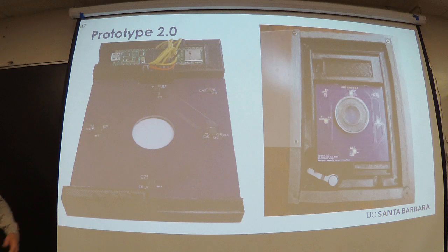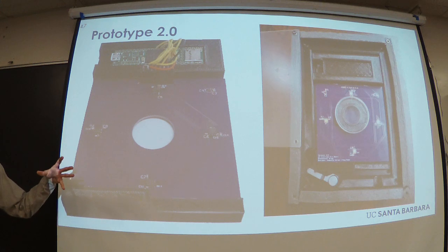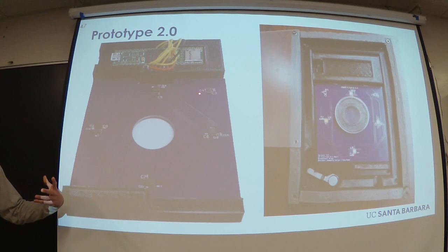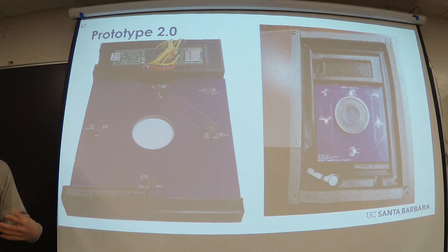And then this is prototype 2.0, with the microcontroller plugged into the system, which is all assembled. It's a little hard to tell that the electrodes are on there, but that's because they're transparent, so that's by design. But they're there, I promise. And then this is the whole system in this fixture that I designed, which is in the box that'll ultimately go into the inverted microscope.